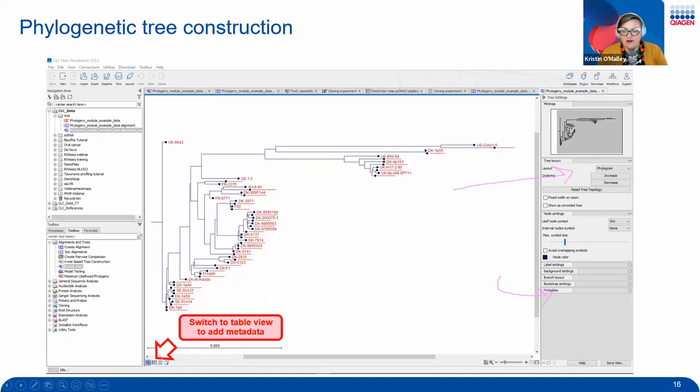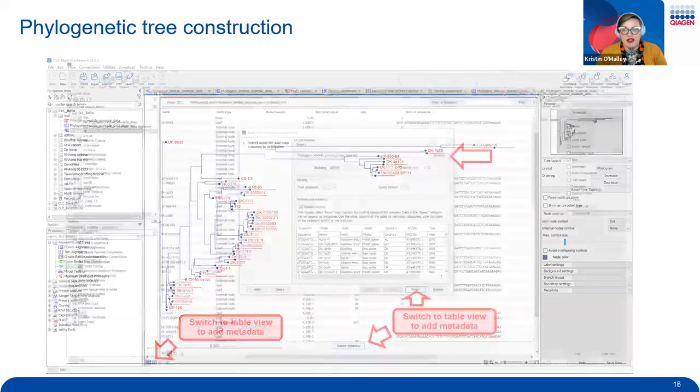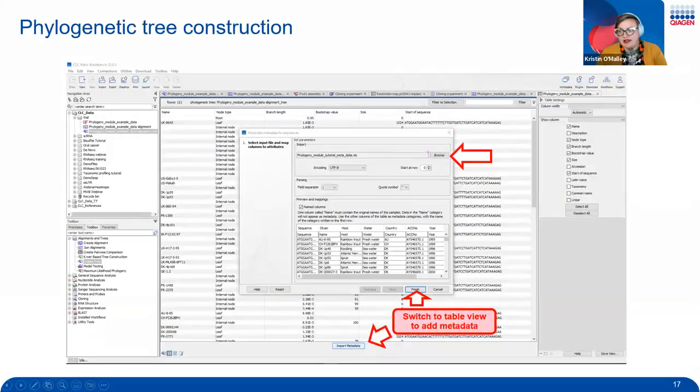And we did so by visiting the view icon at the bottom of the screen that looks like a little Excel spreadsheet, which then opened up a wizard asking, hey, where is this metadata stored that you want to drag into CLC? We had a nice little preview of it, and then we went ahead and clicked on Finish.